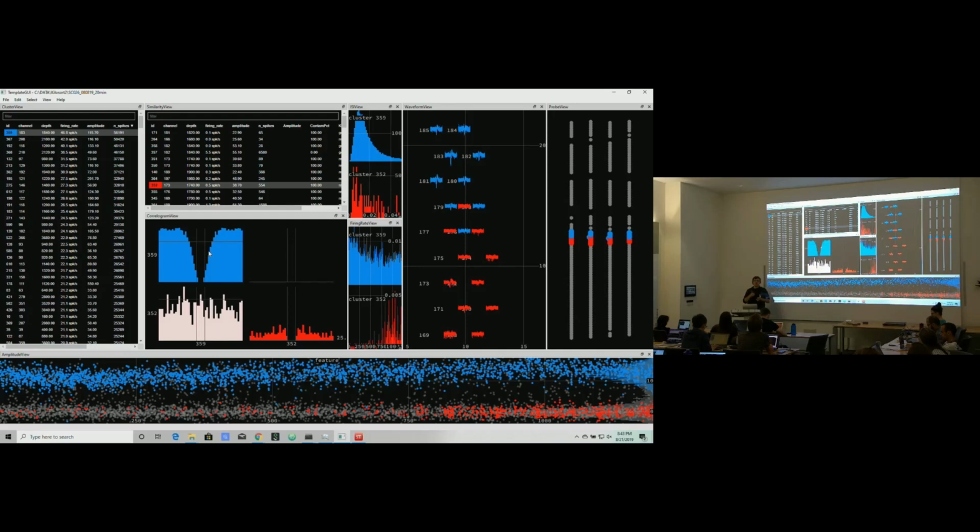So how do we check that it's not a merge of multiple neurons? Any ideas? Say again? Right, and I heard ISI over there. Right, so that's here, the Correlogram view.